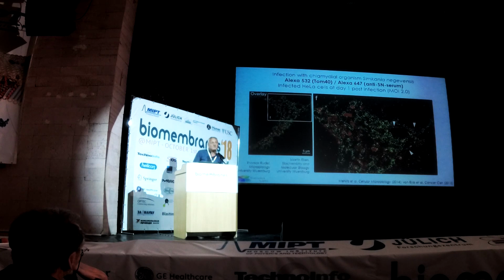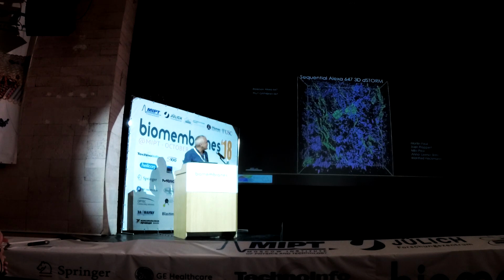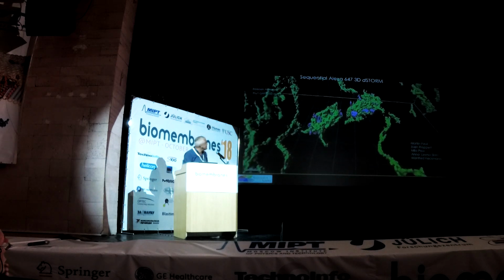Okay, what else have we done in the last years? In many other groups, we established then not only cellular imaging, we also established 2D, 3D localization microscopy in tissue, like, for example, here in brain slices, 24 micrometer thick brain slices, and we can reconstruct finally together with the groups of Manfred Heckmann and Annalena Sirene in Würzburg, neurobiologists.